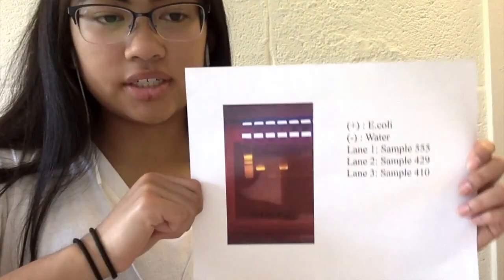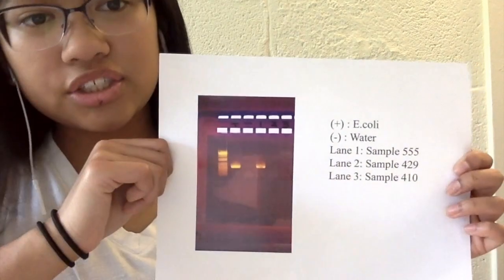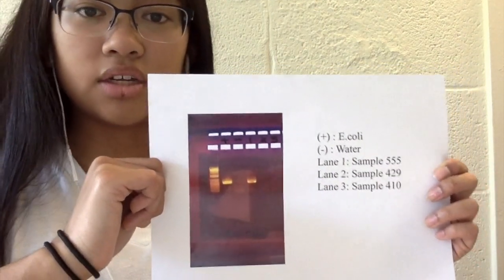Here we have our gel results. In the positive lane we have E. coli, in the negative lane we have our water, and then in lane 1 we have sample 555, in lane 2 we have sample 429, and lane 3 is sample 410. The gel shows the amplified 16S RNA sequence for sample 555 and 410, both resulting in a good reading.